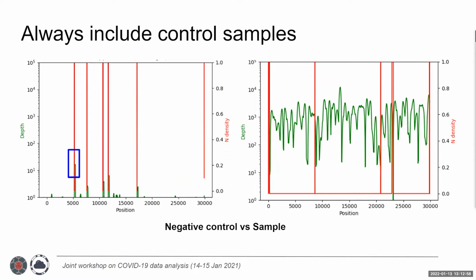And if that's something that's throughout all of your samples, that's a problem, because you might get some sort of weird hybrid fake thing, which will give you a weird lineage call. And there are cases in the press where people have had this problem where cross-contamination occurs and they get led down the garden path and think that there's something going on, and there really isn't.